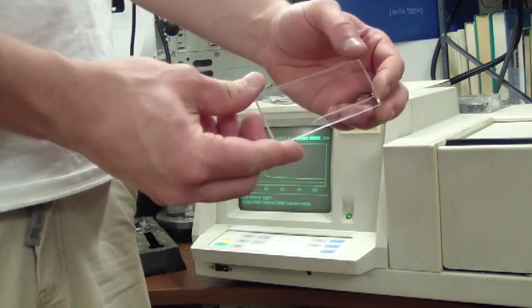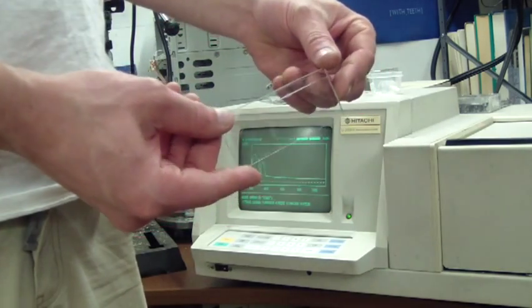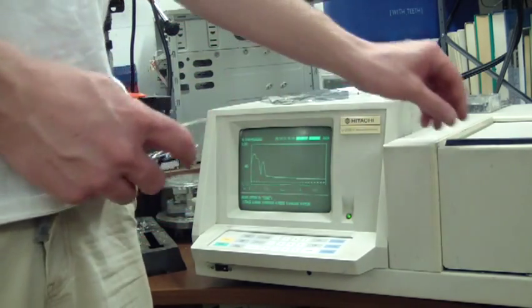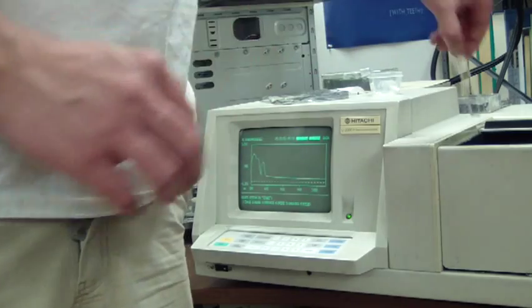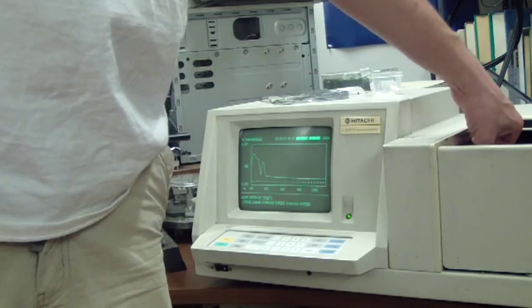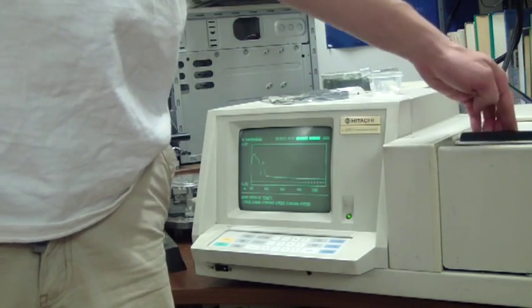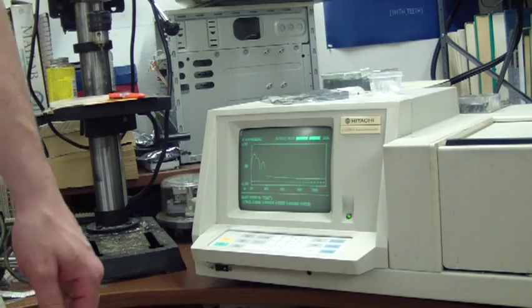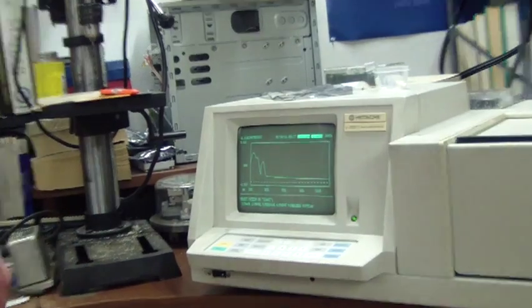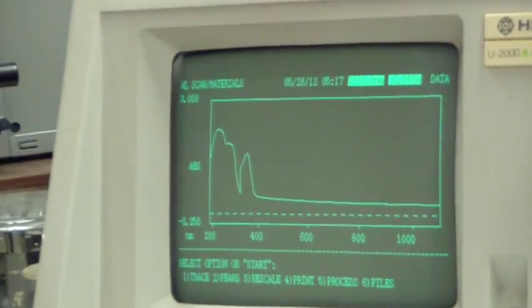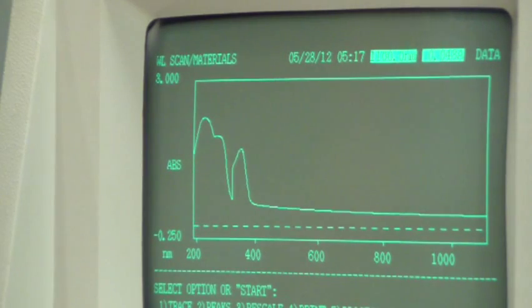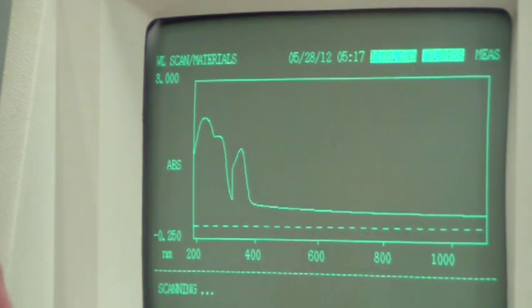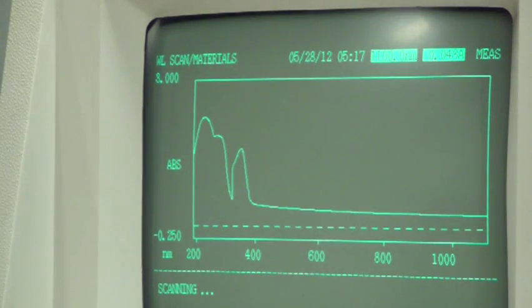Now we will not have the coating anymore. We are going to run the same method again and we will draw right over top of this graph so that we can see an apples to apples comparison.